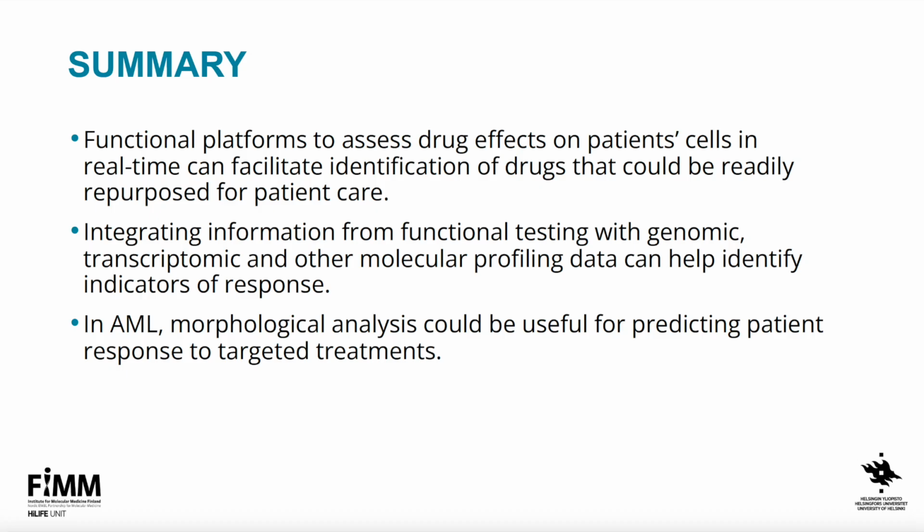And we're really looking forward to pushing this forward and investigating a bit further how we can use morphology to predict response, not only to a drug like venetoclax, but to other drugs as well, and also other blood cancers.